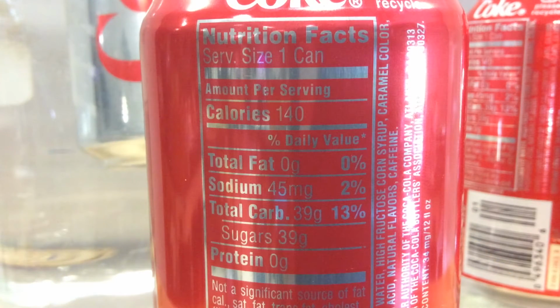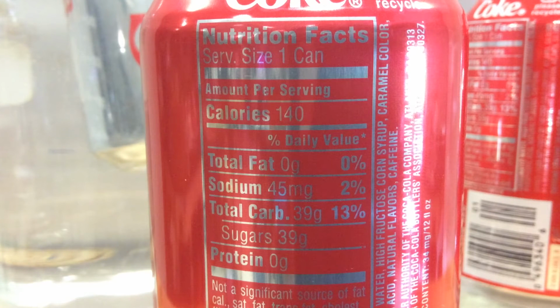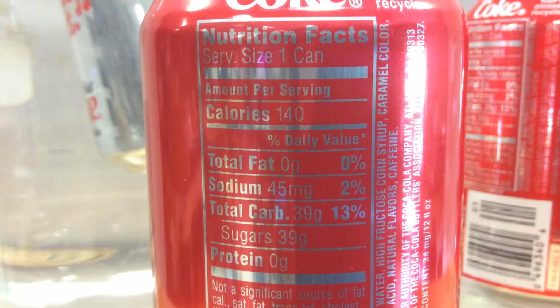So we can read the nutritional facts on the Coca-Cola can, and we can see toward the bottom here total carbohydrates is 39 grams, and that's sugars, 39 grams of sugars, and that's going to be our accepted value that we're going to use in our percent error there.